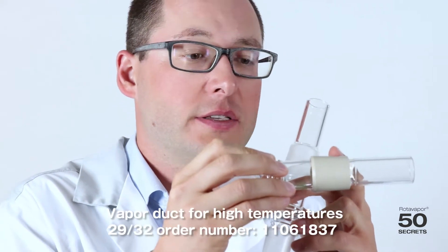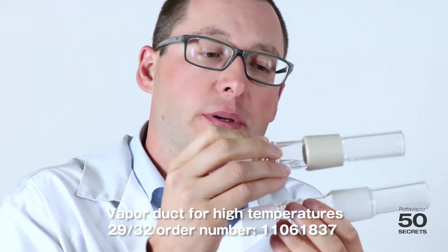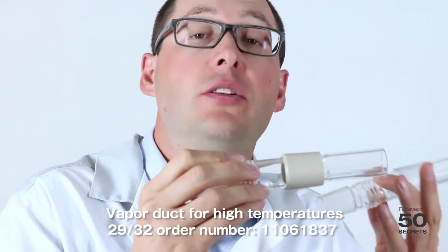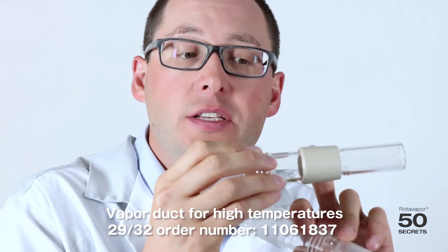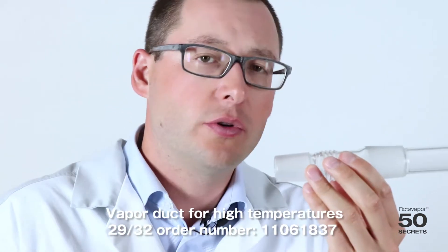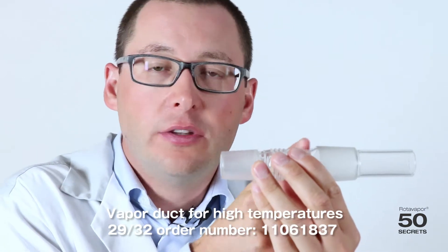The third vapour duct is the same length and same diameter, but it has a plastic piece on it. It's made out of PEEK, a very expensive plastic. The main purpose is for hot applications, such as bitumen for example. This one is very easy to remove from the motor. Customers who were not able to get the vapour duct out of the motor — with this one, there is no issue at all.